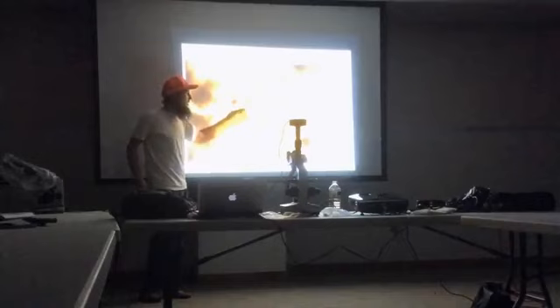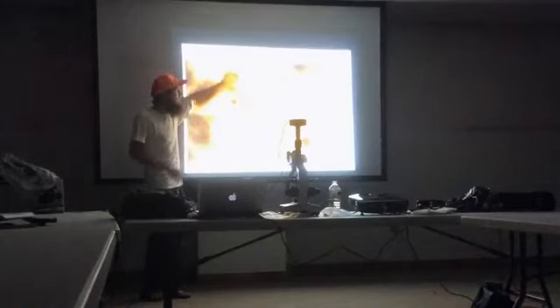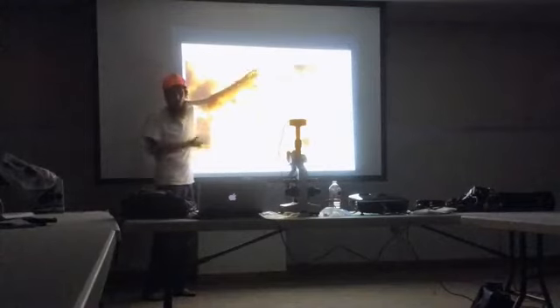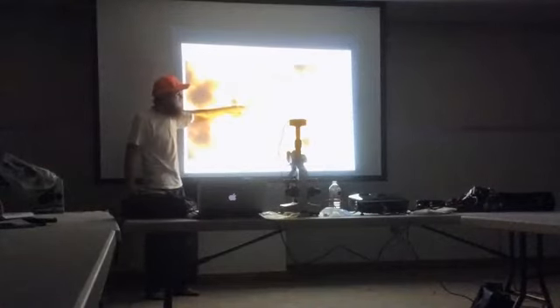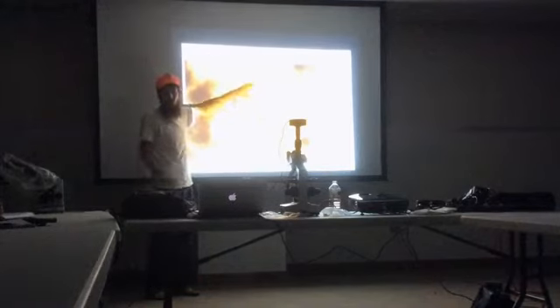So I'm just looking for the fungus, which are easy to see, easy to identify. I don't have to worry about DNA sampling these guys to find out who they are. I know if this guy is here and he's beneficial, then they're good guys and they're on his team. They're hanging out together.